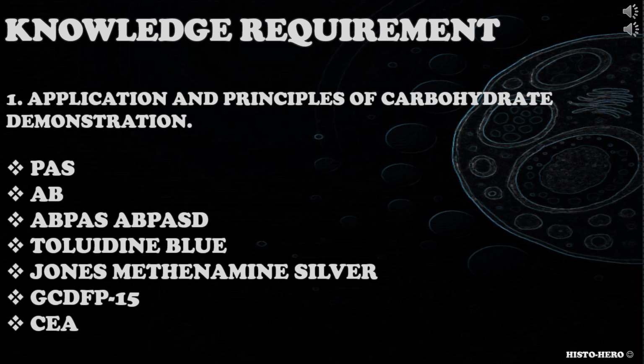The first knowledge requirement is for you to know the application and principles of carbohydrate demonstration. What carbohydrate demonstration methods do you use in your practice? What are their principles? How can results be applied in clinical setting? How would you troubleshoot them? Consider the stains highlighted in the indicative repertoire and stains used in your department, their application and principles.